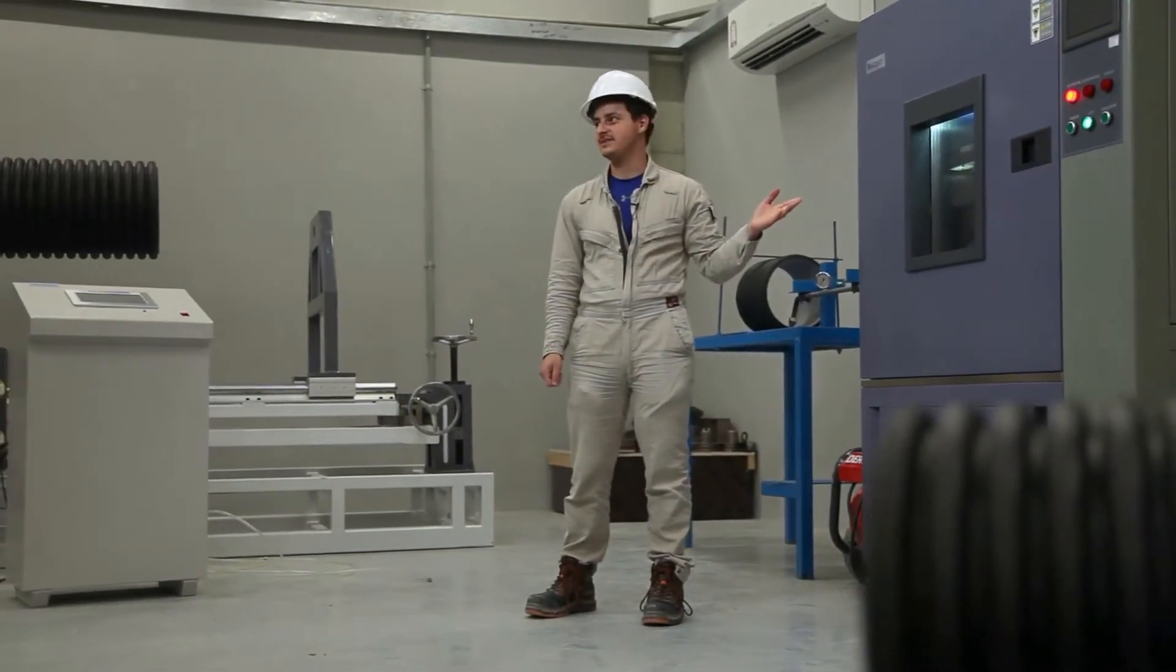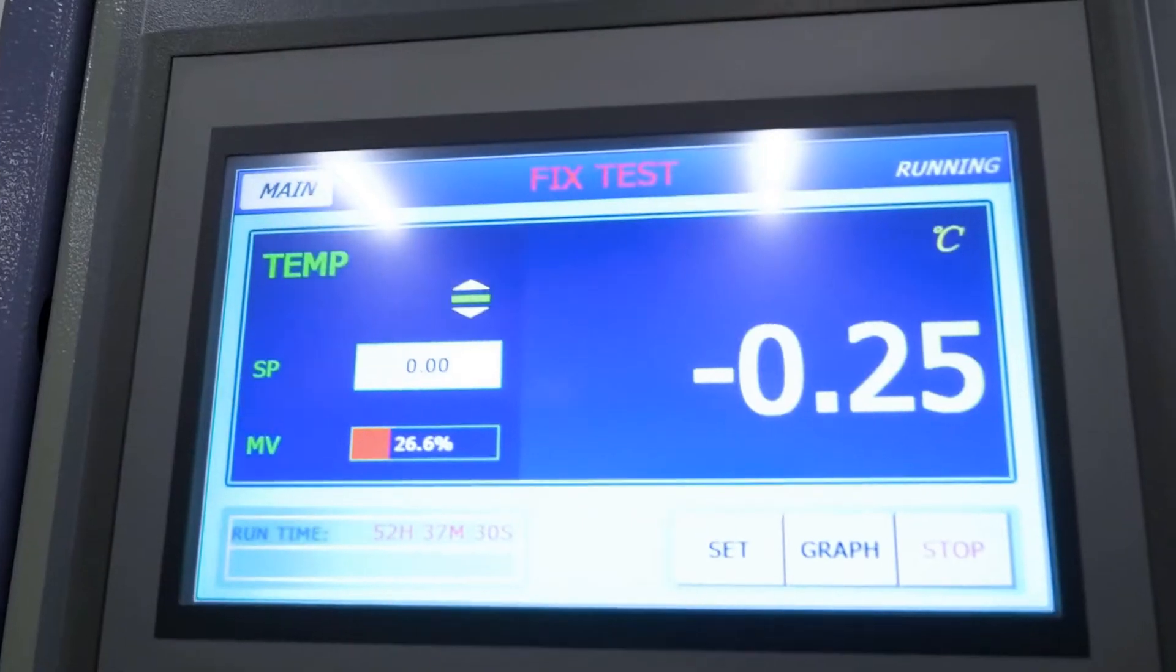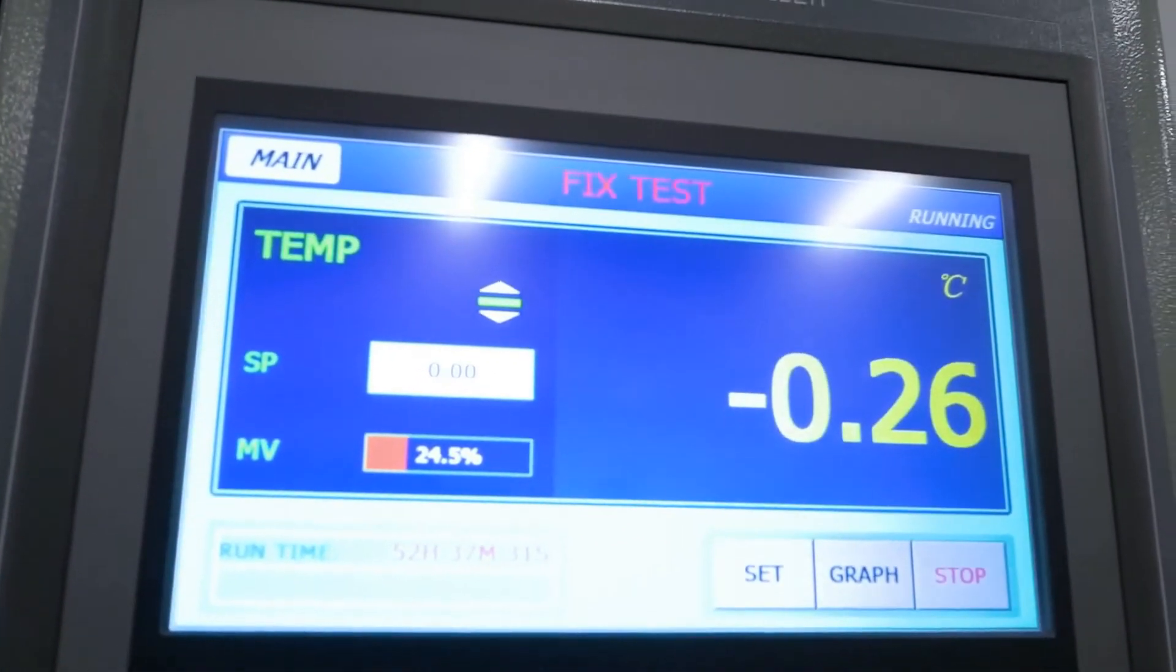This machine is a freezer. The purpose of this equipment is to freeze the pipe to zero degrees Celsius so that we can use it for the impact test, which I will now show you.